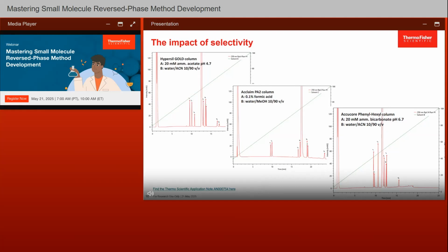If we looked at other phases such as polar advantage or phenyl-hexyl, we can start to see a change in retention time and elution order, and also an improvement in the baseline resolution for certain impurities. The retention time significantly changes with polar stationary phases, as now we gain a higher hydrogen bonding capacity. So it clearly stresses the importance of, when you develop an HPLC method, to understand the molecule of interest and also to explore what other phases can be used to see how that selectivity would change and any improvement that can be achieved by alternative selectivity.